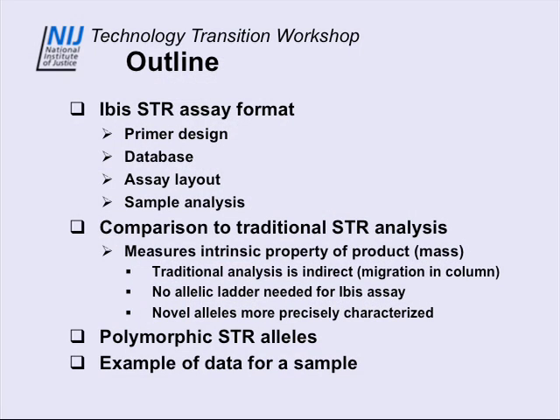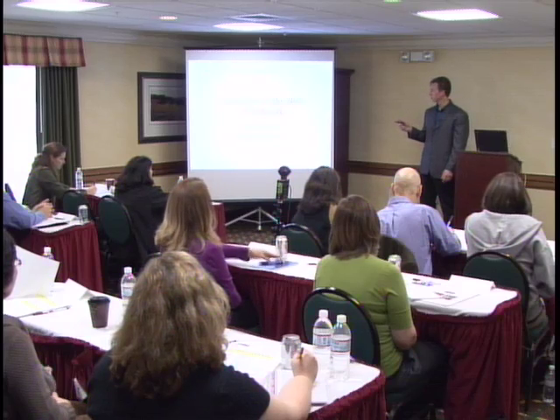I'm going to quickly go through another assay we've been developing for standard STR analysis. Before I start, is there anybody in the room who's not familiar with short tandem repeat assays in general? I was assuming a lot of people here do forensics analyses and are familiar with short tandem repeats. Yes, they should be. Okay, so I'll just proceed. Well, that way I'll go straight into it. Okay.